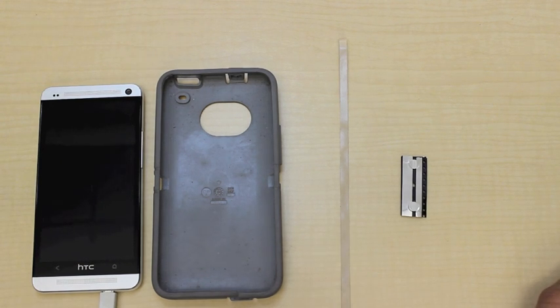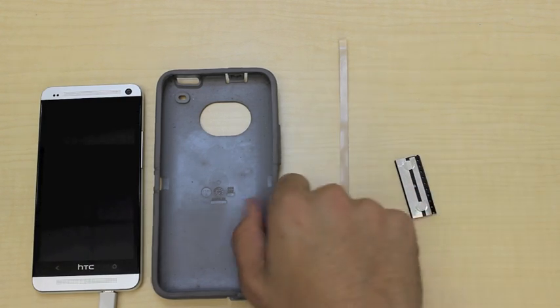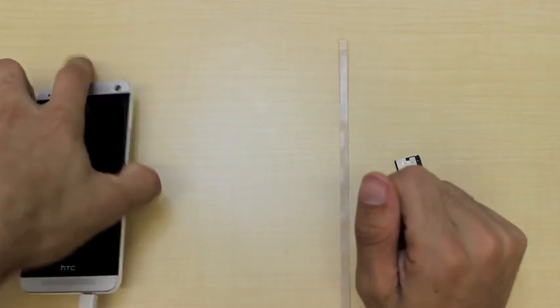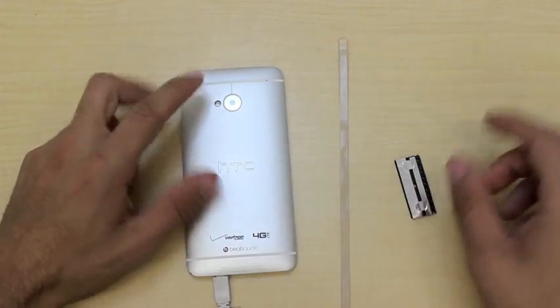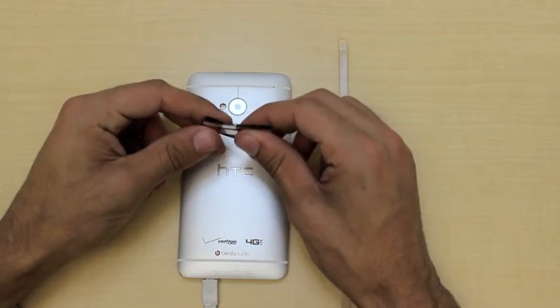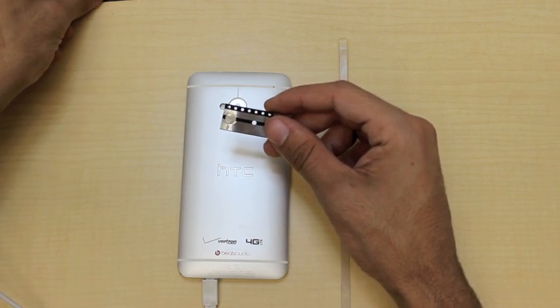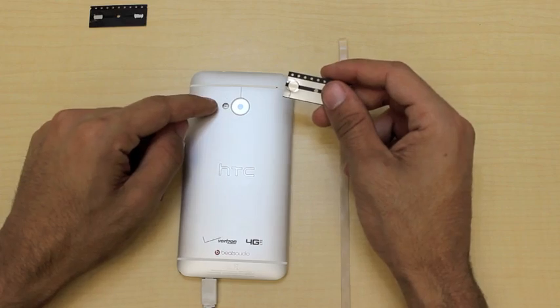In this first step of coupling our phone to our foldscope, we're going to attach one of the magnetic strips to our phone. I've already taken off the case of my phone because we want to get the strip as close to the camera as possible so that it won't restrict our field of view. We have two strips — one silver and one black — and we're going to set the black strip aside and attach the silver strip to our phone.